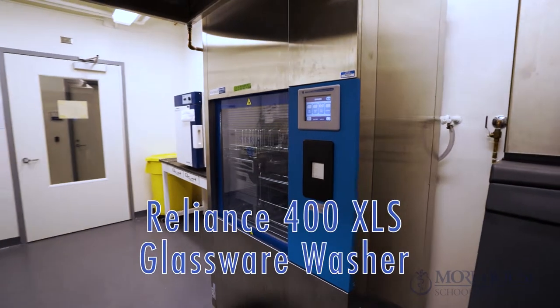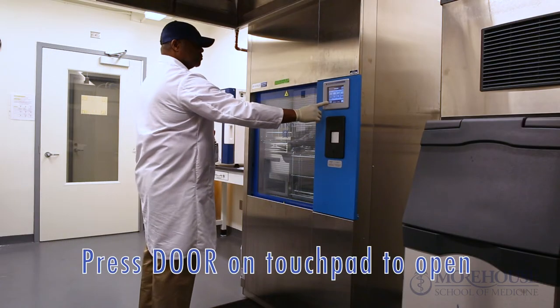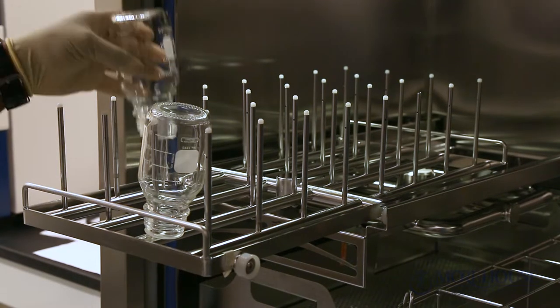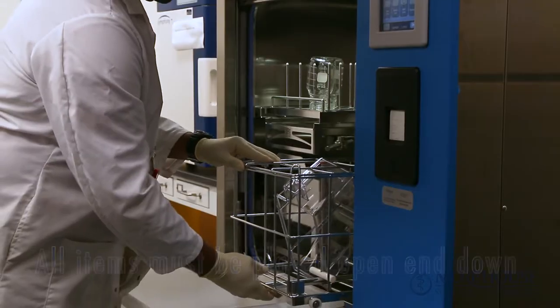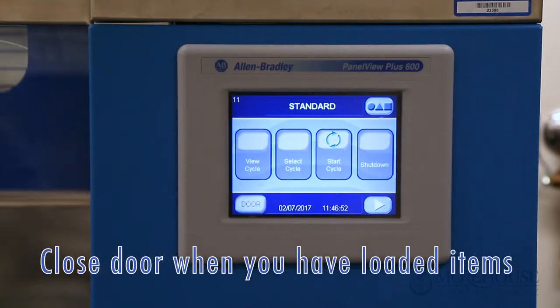Reliance 400 XLS glassware washer — loading the machine. Press the door touchpad to open the chamber door and slide the accessory headers out to load your glassware. All items must be placed open and down. Close the chamber door when you have loaded all items.